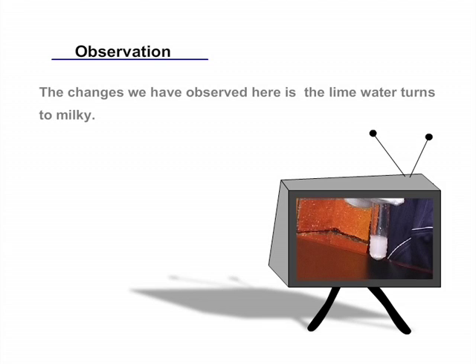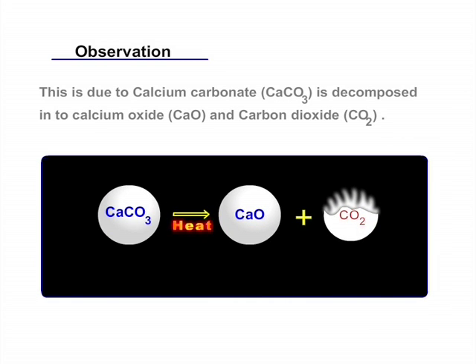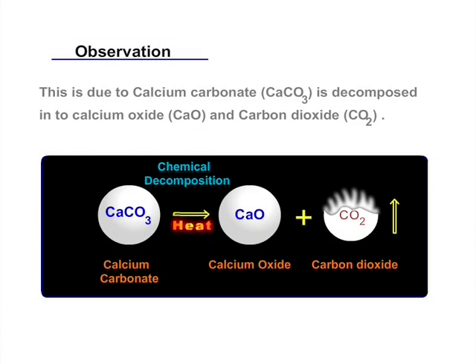The change we have observed here is, the lime water turns to milky. This is due to calcium carbonate being decomposed into calcium oxide and carbon dioxide.